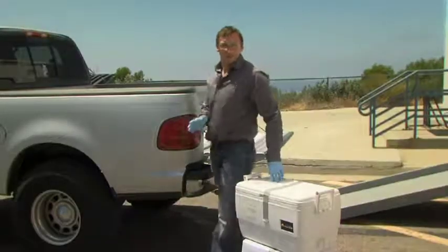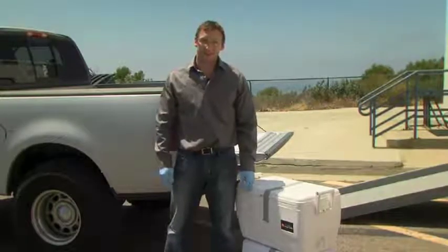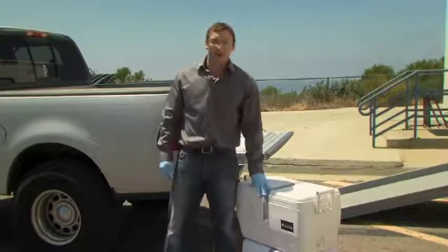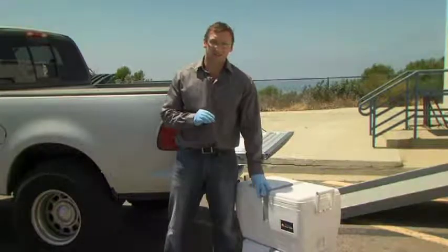The first thing the lab will do is check in the samples according to the lab-specific procedures. In this case, we note whether the container is sealed upon arrival, and then open the chest and check the temperature. Then each sample is inspected.